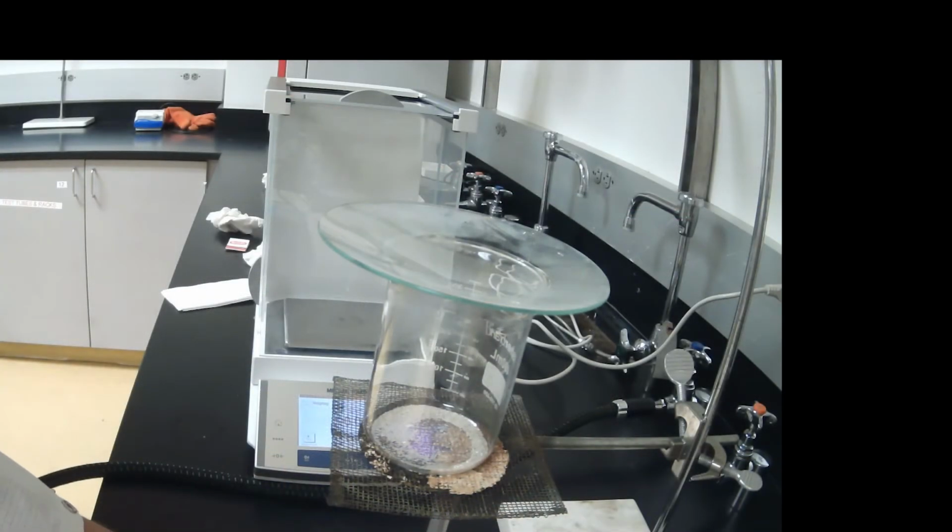So because we removed nearly all, if not all, of the ammonium chloride on the first time, the amount of smoke or smog we see should be minuscule or non-existent. I'm going to put flame heat it where it's the thickest over here on this side just to see if any smoke comes out at all. I'm going to make the bottom of the beaker kind of glow red. You can see the nice glowing in the film.